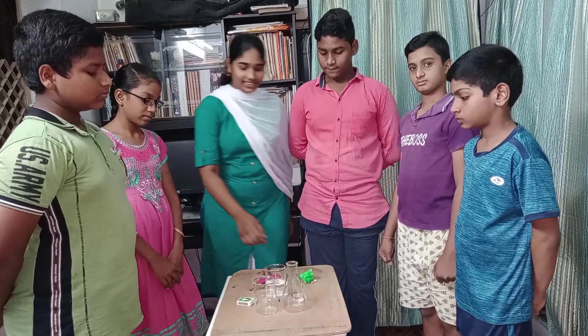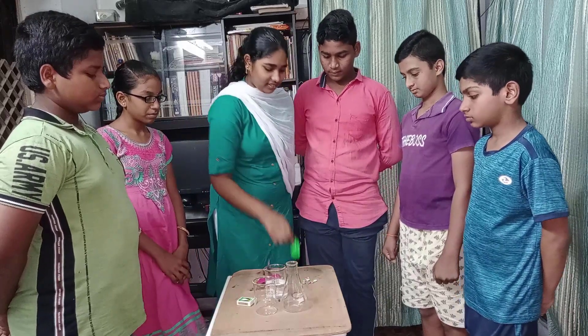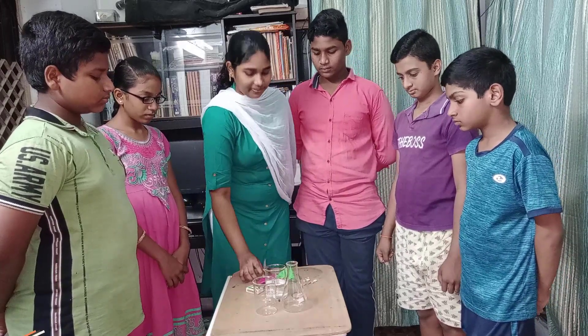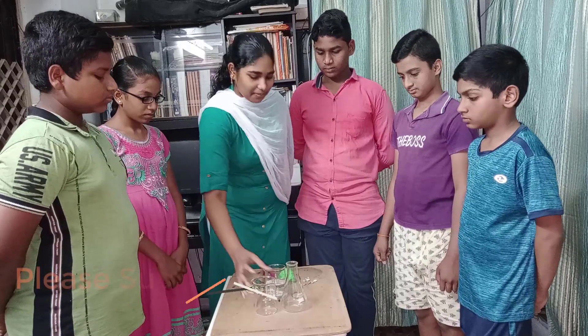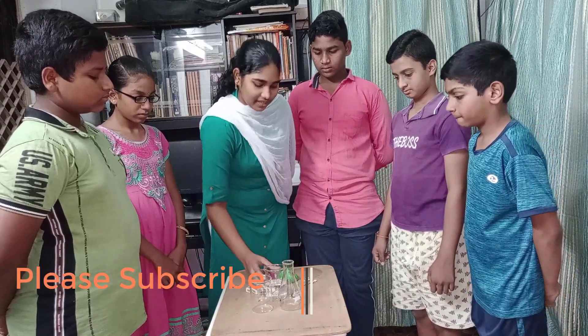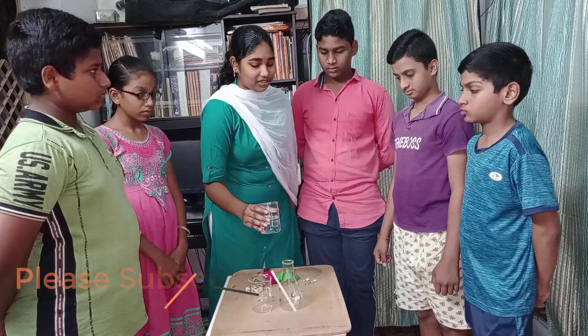Materials required: balloon, zinc crystals, matchbox, thread, beaker, conical flask, and dilute sulfuric acid.